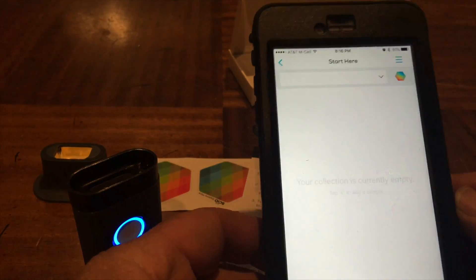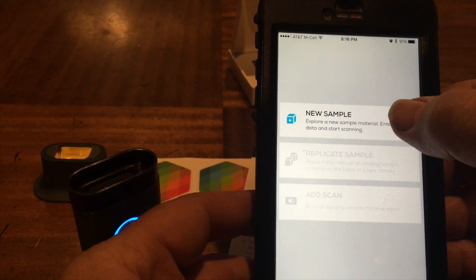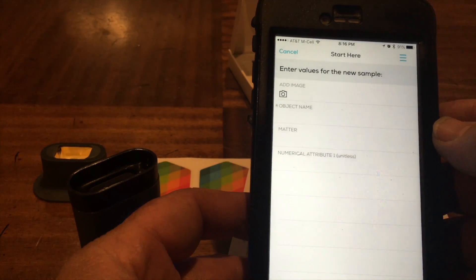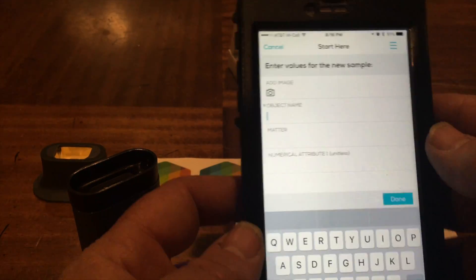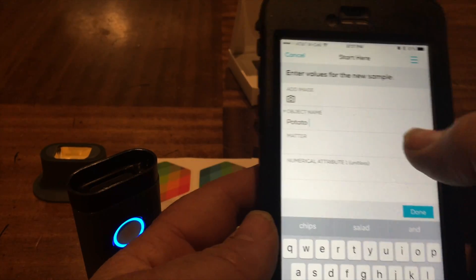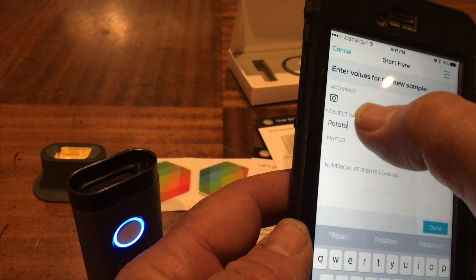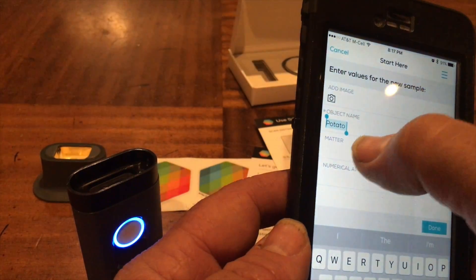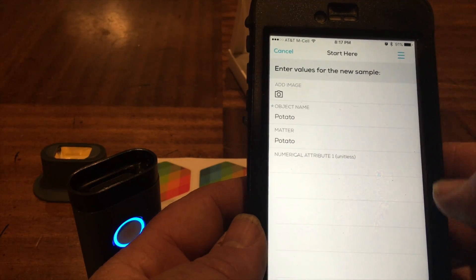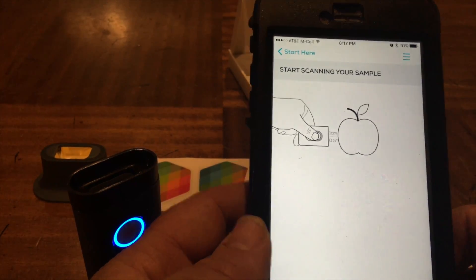Maybe start here - oh it's empty. Test model, new sample, enter metadata. Let's see - this is going to be a potato. Do I have a name and a different numerical attribute? No idea. And what else - next, start scanning.